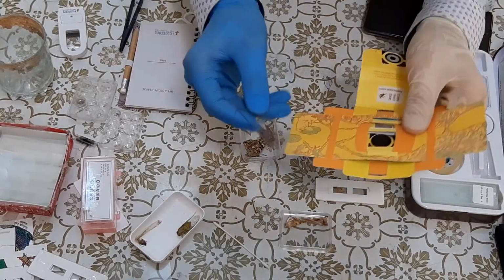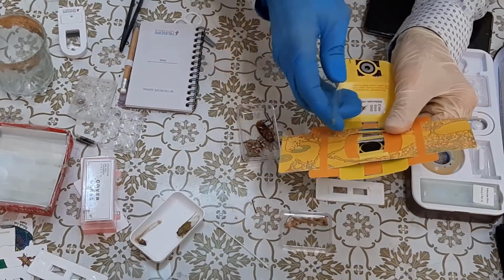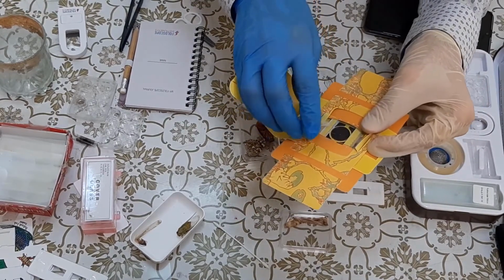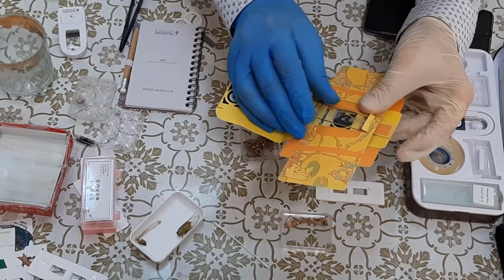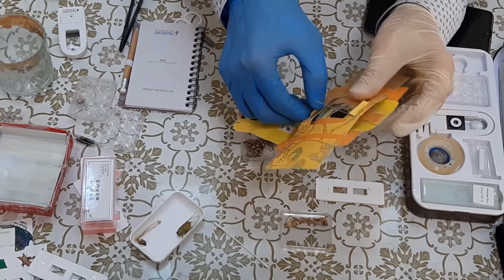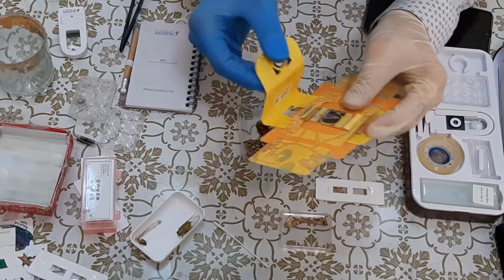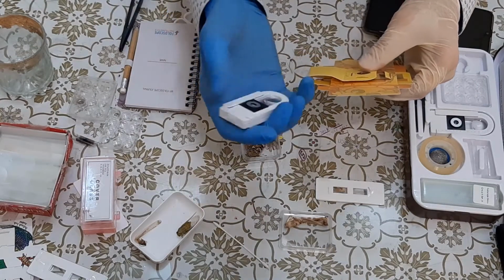So we put the sample in front of the lens, the closest part of the lens, and then we bring the LED.